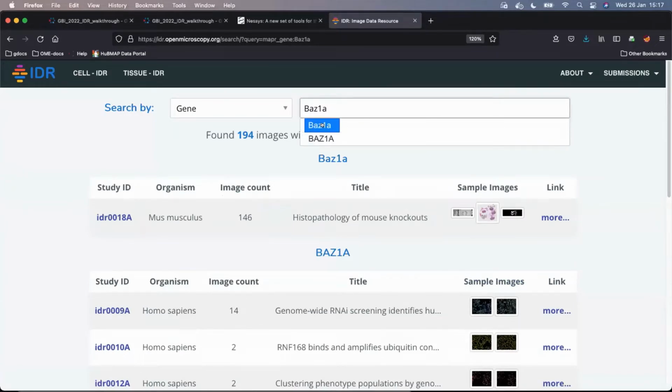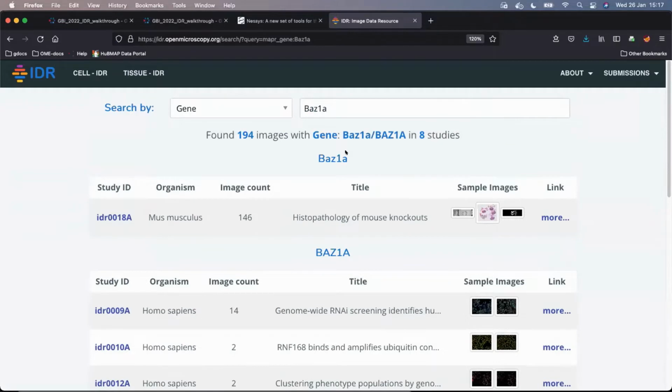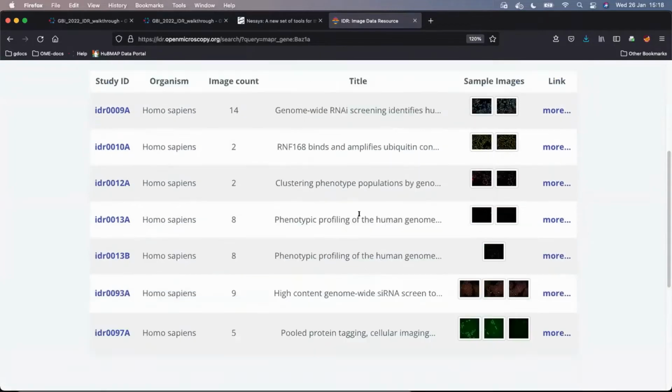If I inspect the autocomplete, the auto suggestion here, I can see that I have two lowercase and uppercase variants, and whether I select any of them, the search is insensitive for that. That's by design. So in this case, it always has the nice effect of not missing some search results just because of the lowercasing, uppercasing.